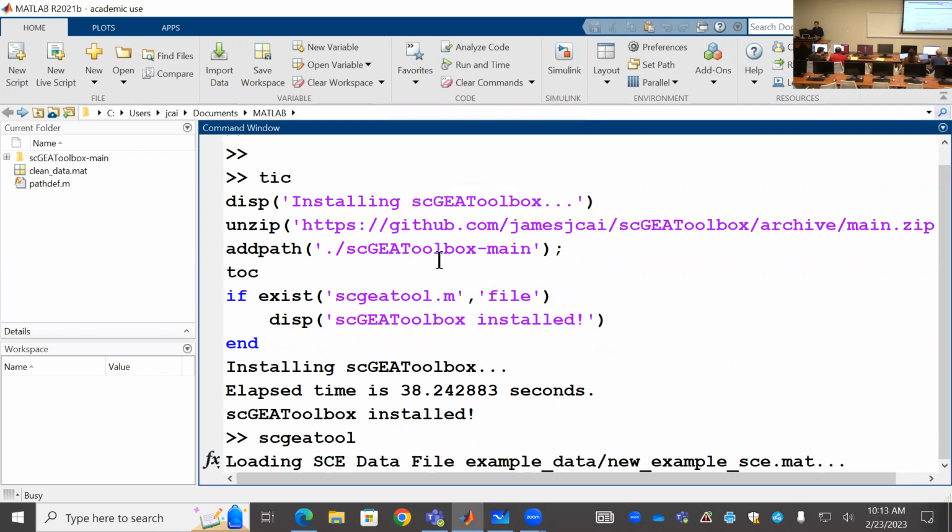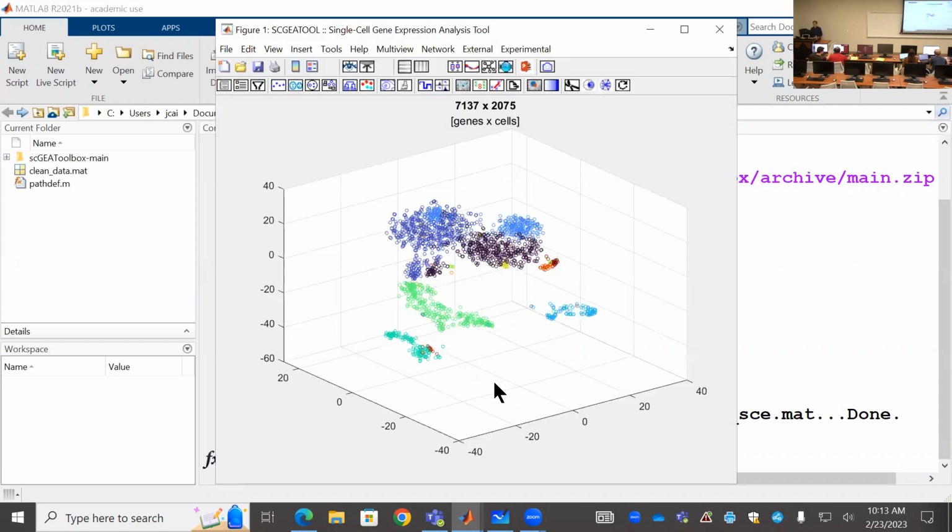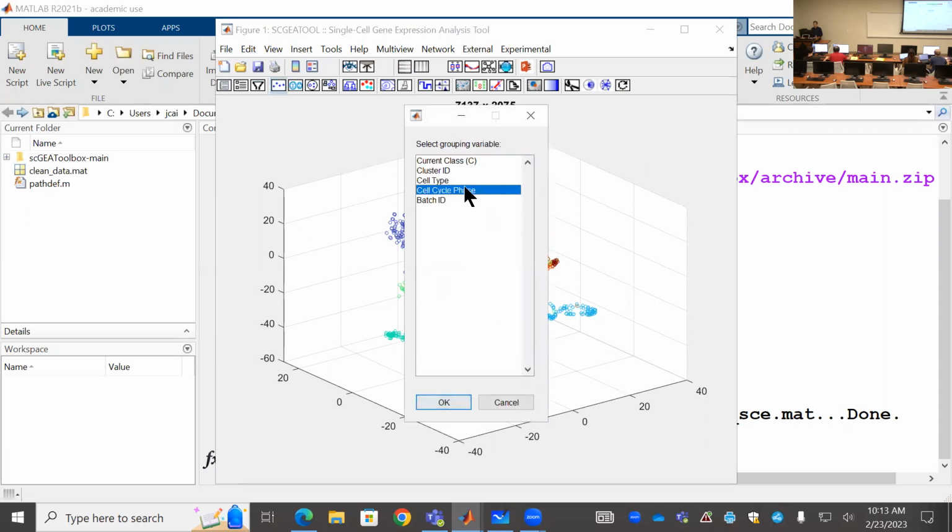So I use this process data to show this new functionality. What I want to show you is this toolbox is highly dynamic. It's always updated. So for instance, you want to make a new cell type now.